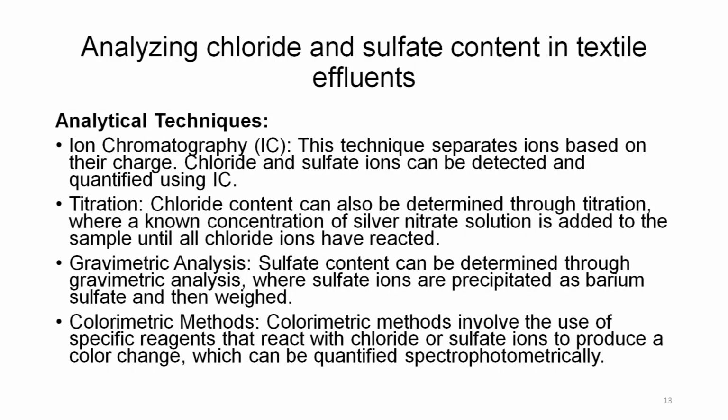Analytical technique. Ion chromatography. This technique separates ion based on their charge. Chloride and sulphate ions can be detected and quantified using ion chromatography. Titration.